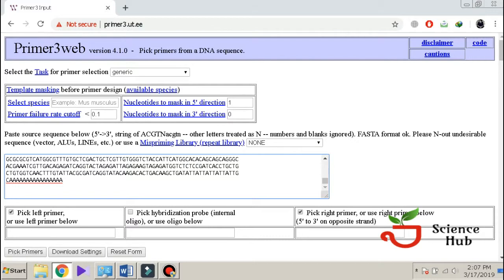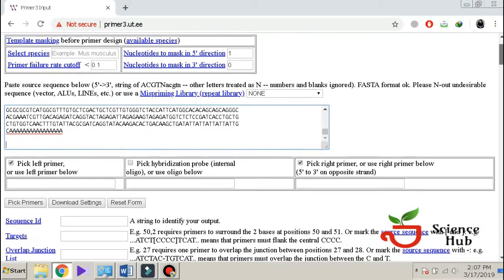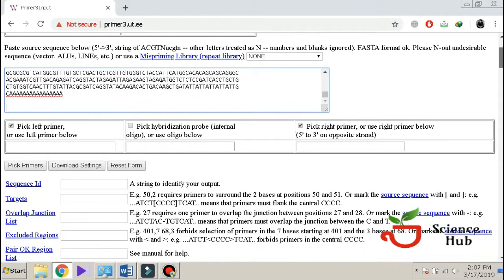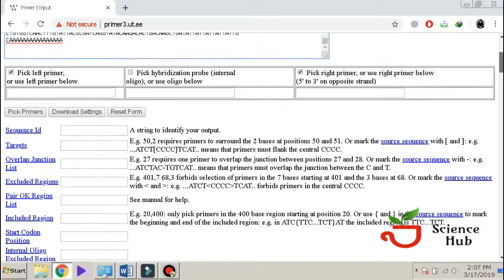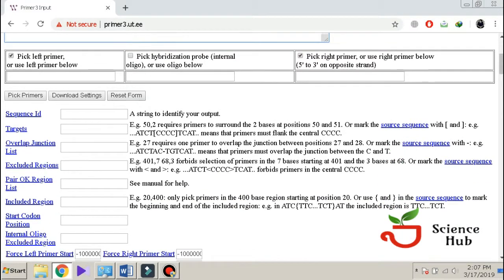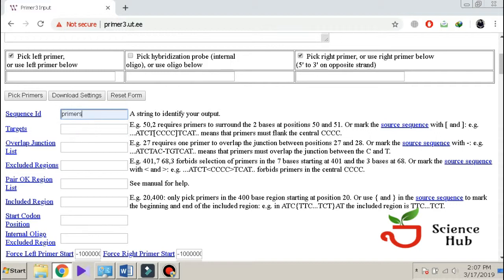All the settings remain normal as it is. We have to pick a forward primer and a reverse primer. We will give it a name, a sequence ID, and if we have any target, we will assign that specific target here.